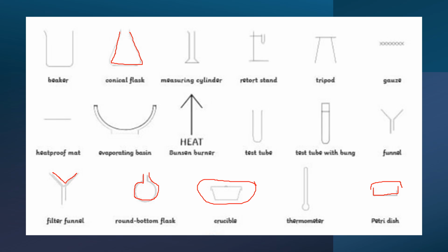Did you see? So just have a look at your textbooks again and remind yourself of each and every apparatus that you are using in the lab and try to sketch. That's the most important thing, because you are not going to attach a picture or a three-dimensional thing in the lab. In the scientific way, you convert this information into two-dimensional.